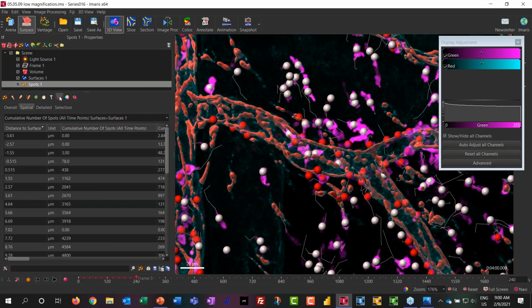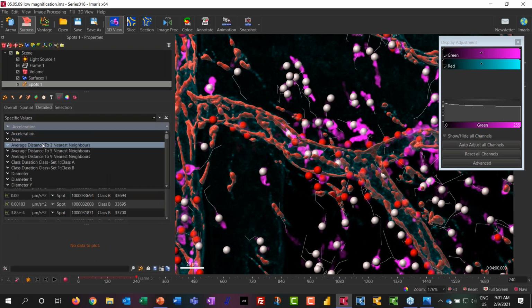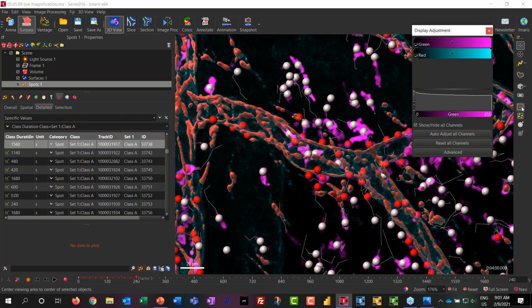If you go to detailed for the spots and then specific values, you will see class duration, and you need to pick the correct class. This is class A, and you'll see, if they are in contact, what the duration of that current contact is altogether. Let me move my GoToWebinar bar.